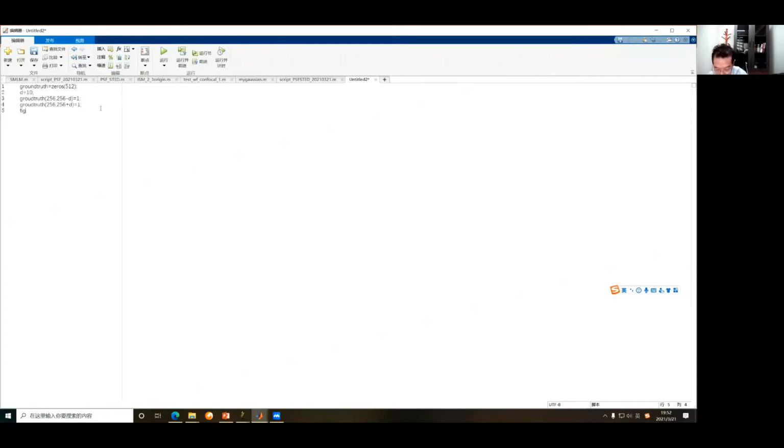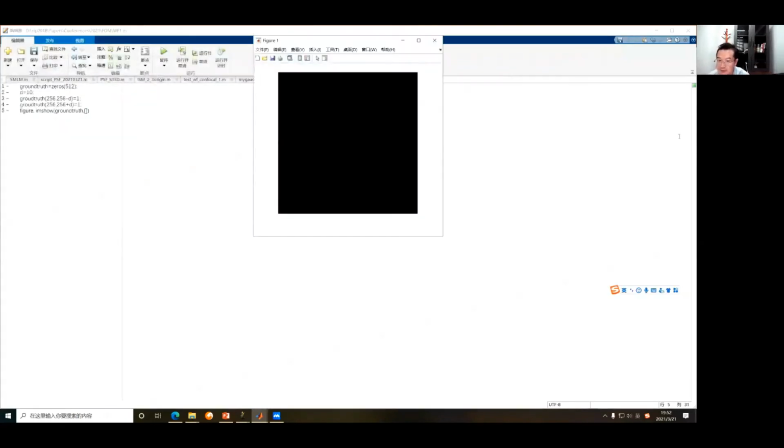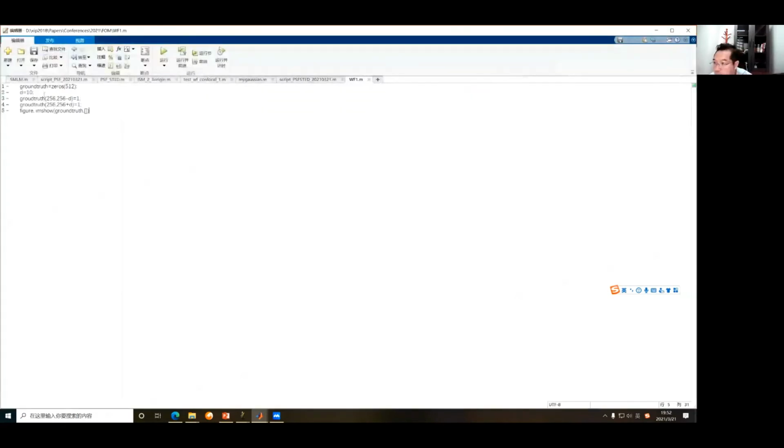And let's take a look at my image. Okay, let's run this script. Temporarily, we term it wide field 1. Why doesn't it pop up? Show ground truth.